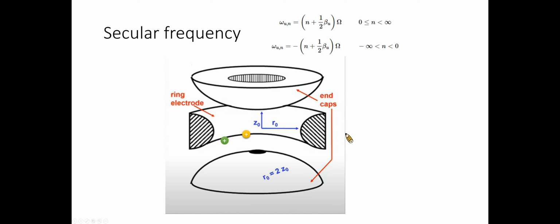Ion motion along each axis is rather complex, comprising numerous sinusoidal components in both dimensions. The frequencies of these components are termed secular frequencies, and they are related to the values of beta. Different ions move in the ion trap with their own secular frequency.